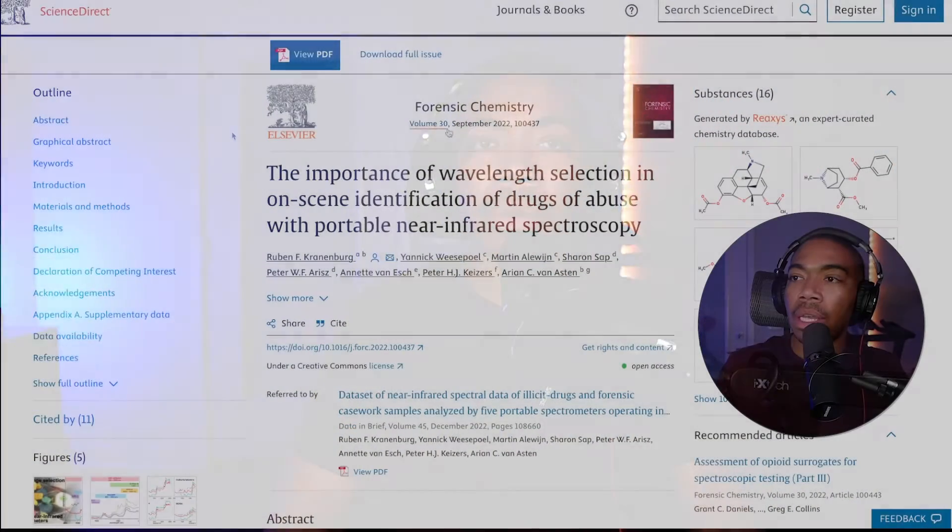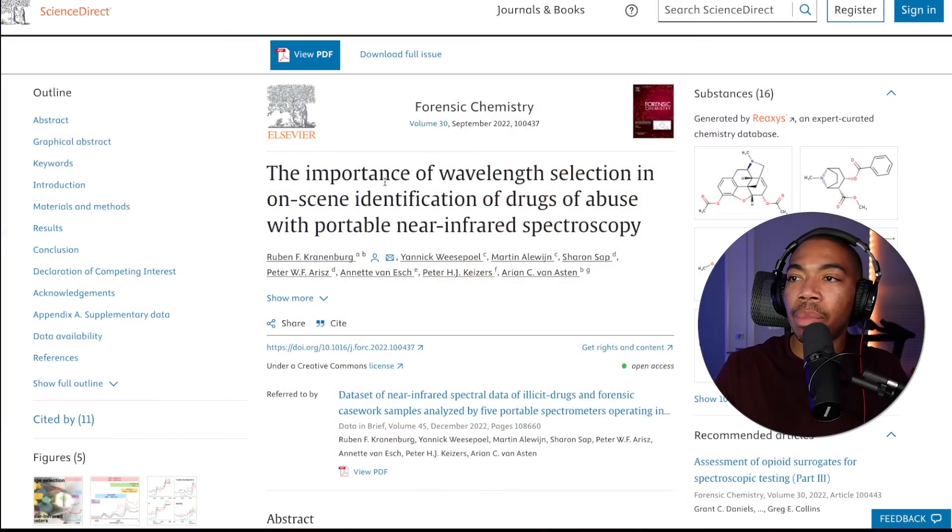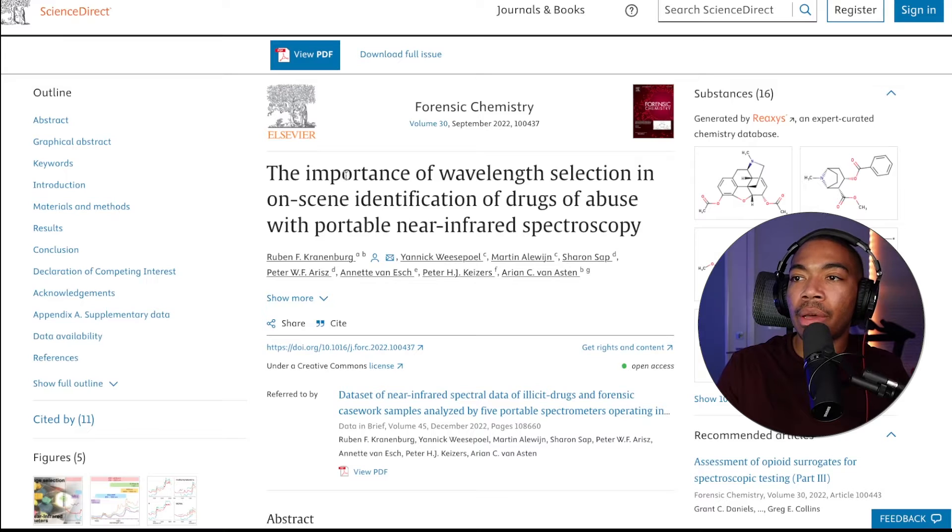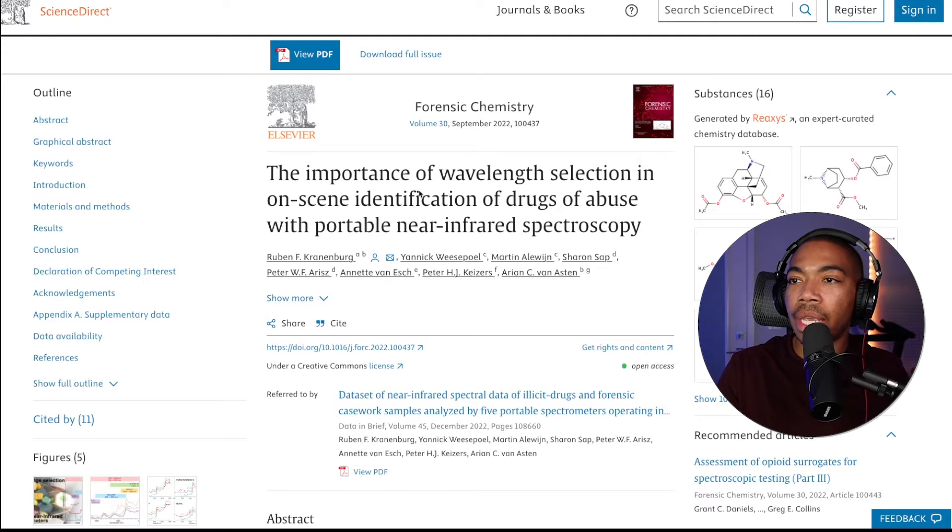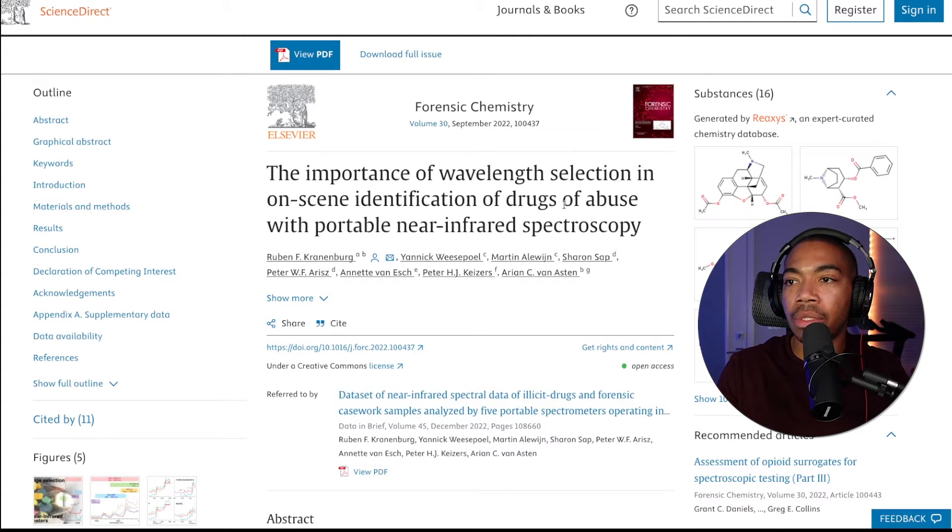Now, the goal of this is to show how the tools we've developed over the past several videos can be reapplied in this context now for forensic chemistry. Here is the paper where we're talking about the importance of wavelength selection and on-scene identification of drugs of abuse.